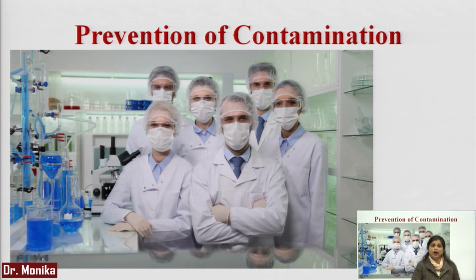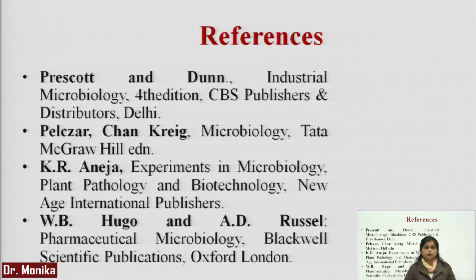So, you have to go for personal hygiene too: you have to use gloves, masks, and lab coats, and all must be sterile, and you have to take extra precautions while working within that area. Personal hygiene is also required to prevent any contamination within the pharmaceutical product.